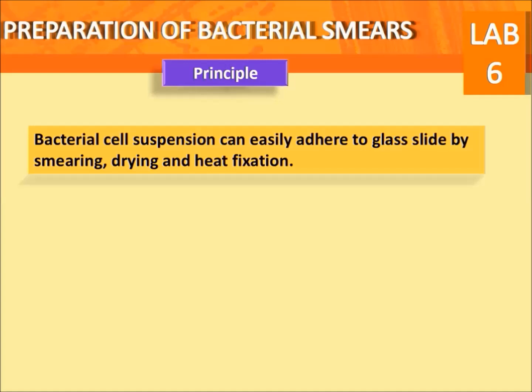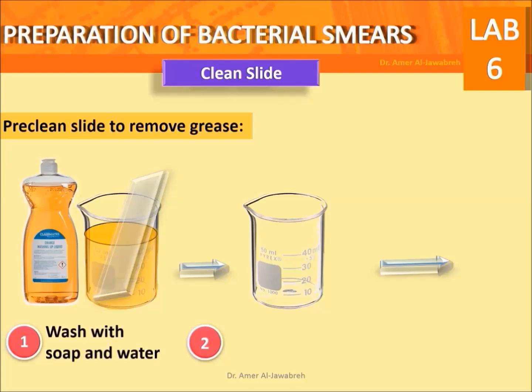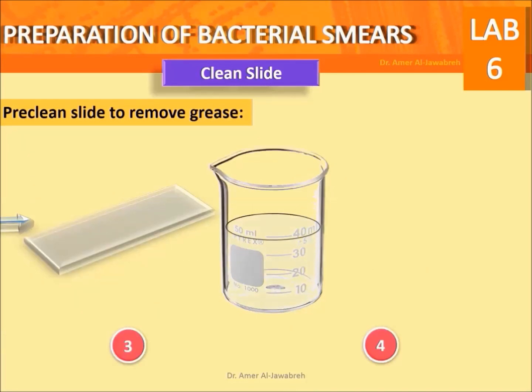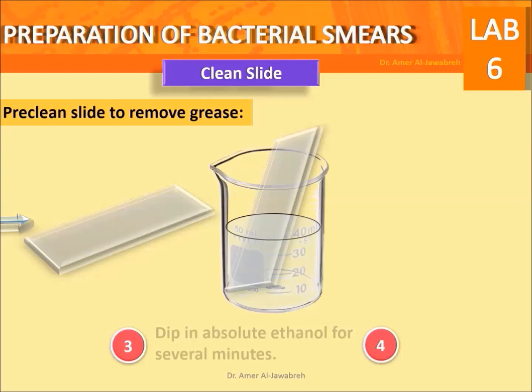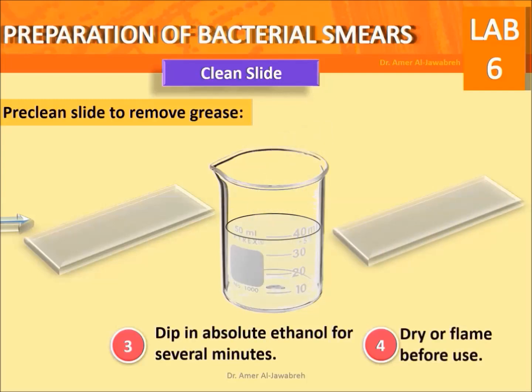Clean slide preparation: pre-clean slides to remove grease. First, wash with soap and water; secondly, rinse with water; then dip in absolute ethanol for several minutes; finally, dry or flame before use. Hold clean slides by their edges.